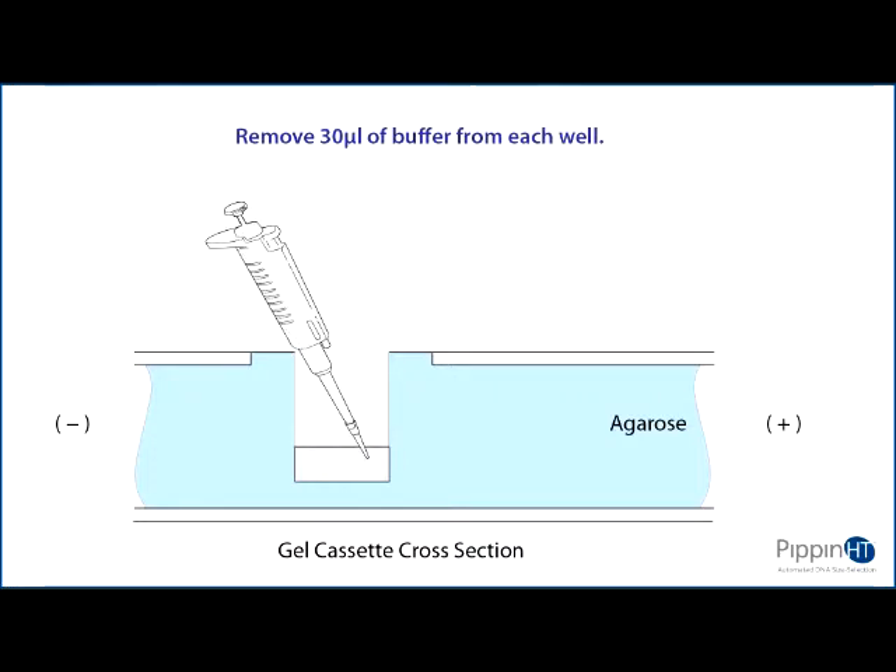When buffer removal is completed, there will be about 10 microliters of buffer left in the well.